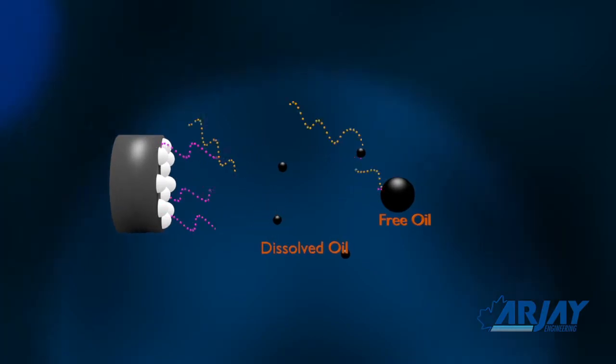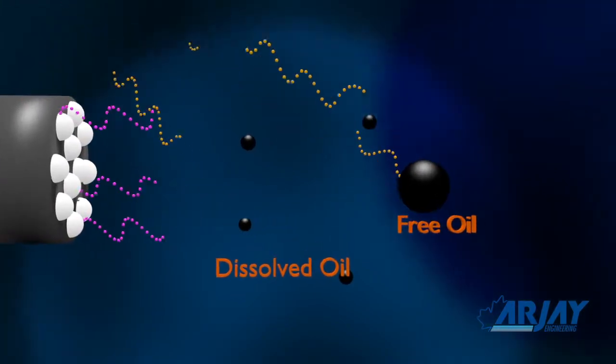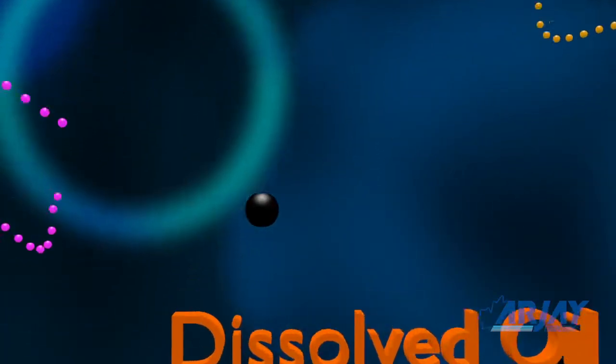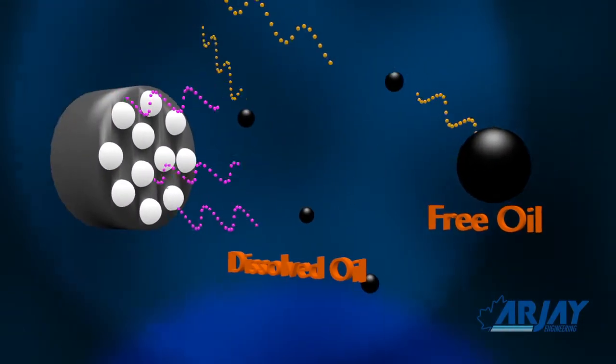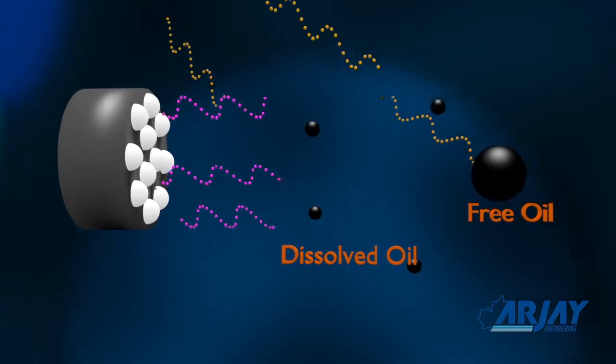The 3410 uses a fluorescence approach to measure free and dissolved petroleum hydrocarbons. A site calibration is required to match the fluorescence reading of your stream sample against a lab-analyzed ppm value.